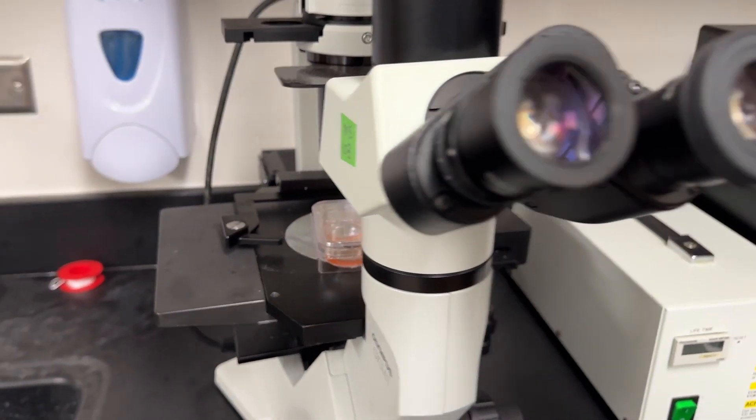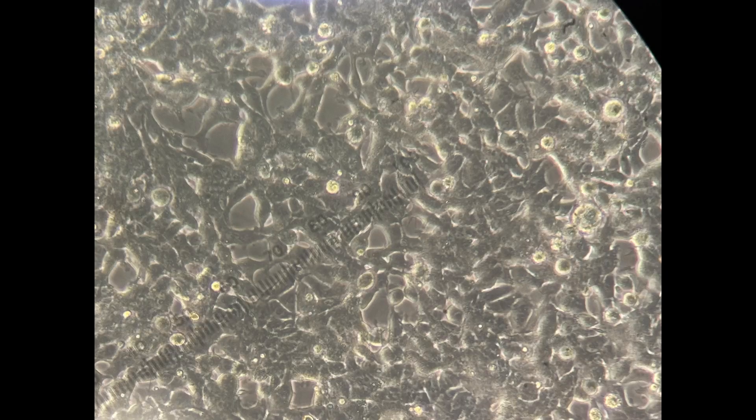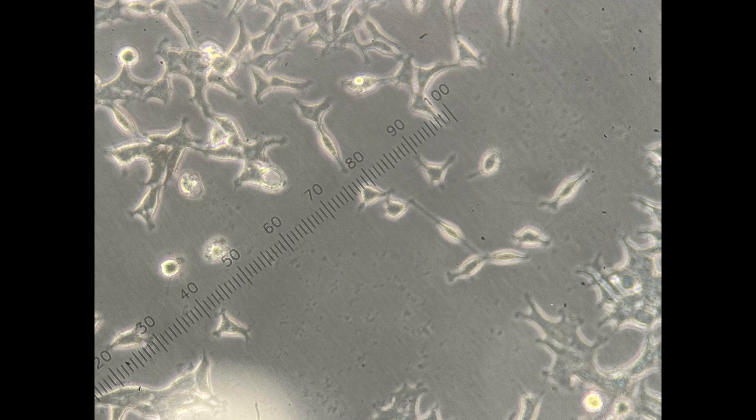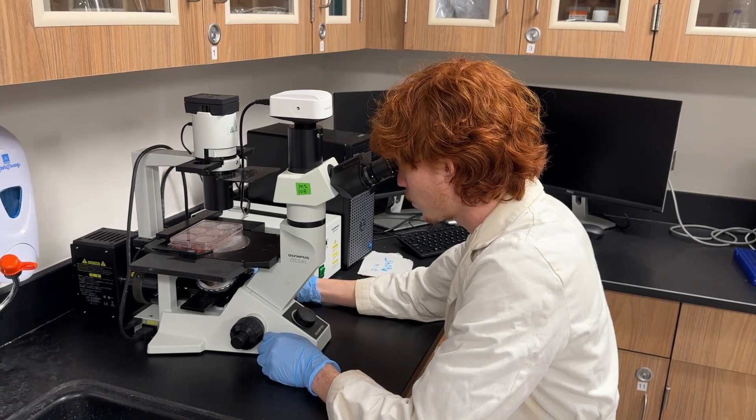At this point Spencer is going to check the cells — in full disclosure, this was done before because it's much more efficient. We put the plate on the microscope and look for confluency: how covered is the bottom. We'd like something like 75 to 90% coverage. Something too sparse means we don't have enough cells to do a proper transfection.